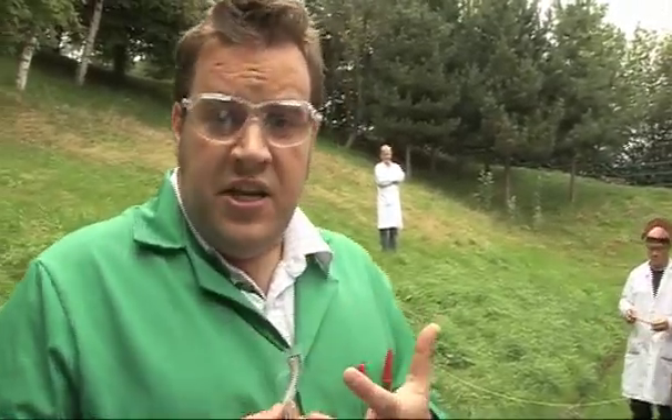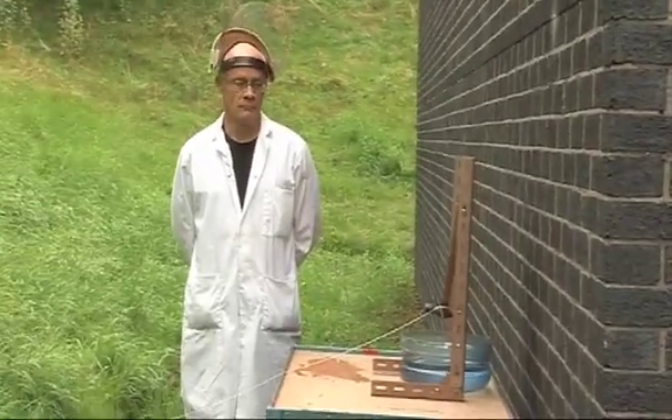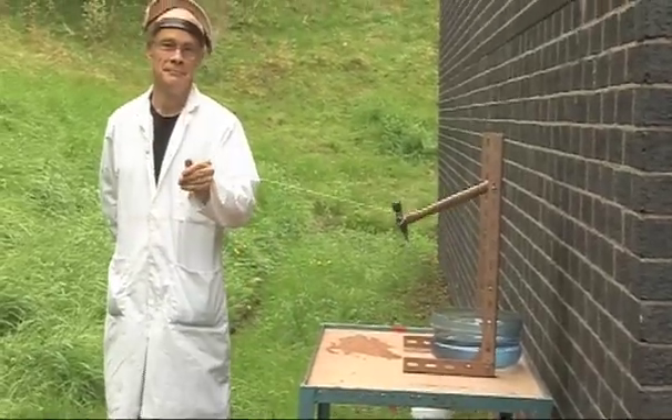We've got this really neat device which Neil put together last Friday, and you can see it's got a hammer which is going to break the glass. So when the hammer falls, we'll break the glass and the rubidium will just drop into the big bucket of water that we've got underneath.